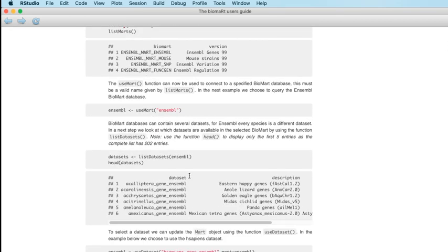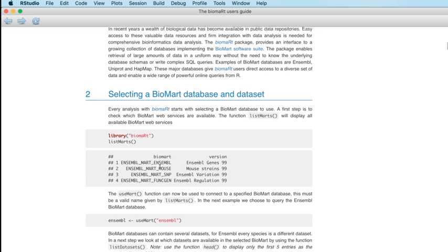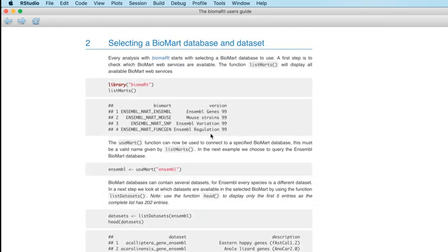And so we can, if we want, work through this vignette to figure out how to get from A to B to C to get us to a point where we can query biomaRt. So what I'm going to do is take this off the screen, but I am basically going to work through this document because I think it's reasonably illustrative.